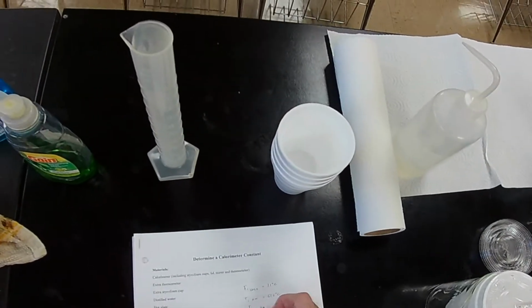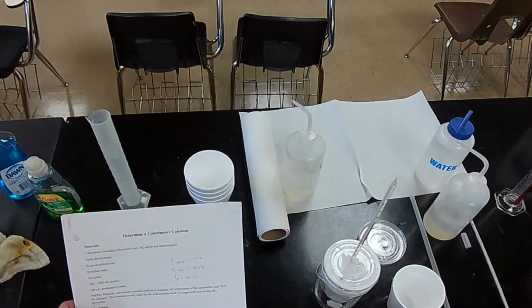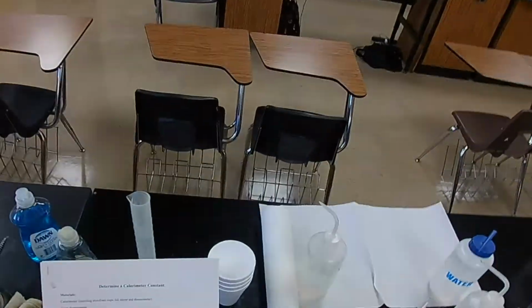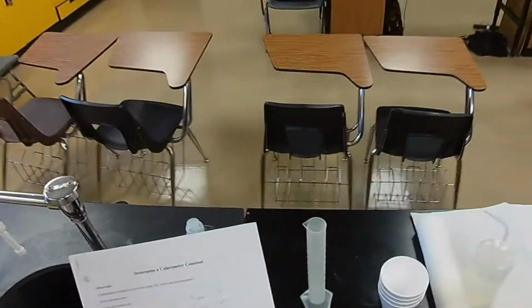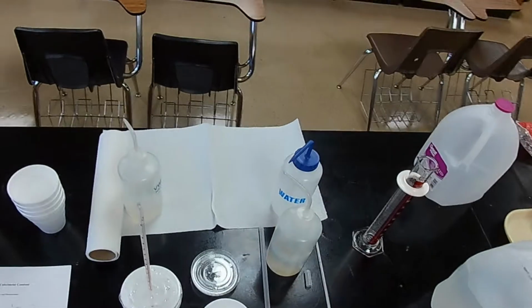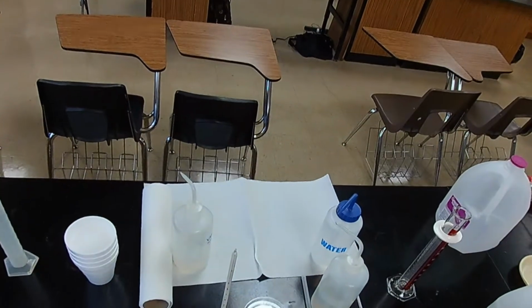So 40.5 degrees C. Notice that the cold temperature and the hot temperature were about 40 degrees apart, and now their combined temperature, since they were equal masses, 75 and 75, is in the middle. But it's not exactly in the middle. Why is that? That's because some of the heat that was added with the hot water was used to heat up the thermometer and to heat up the rest of the calorimeter. And that's the heat we want to account for.